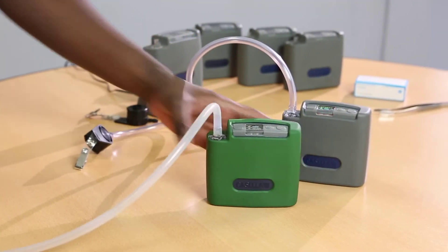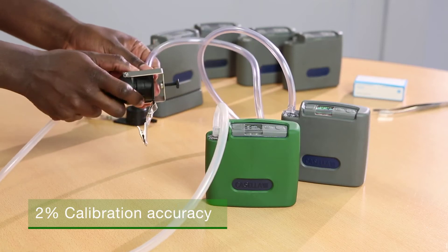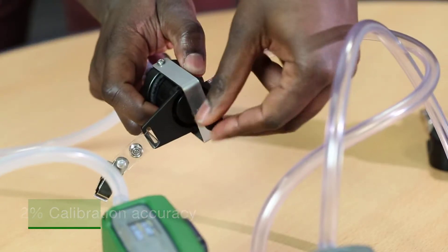The Flow Detective is a flow meter used to calibrate personal sampling pumps to ensure accurate calibration when sampling for dusts, fumes and vapours.